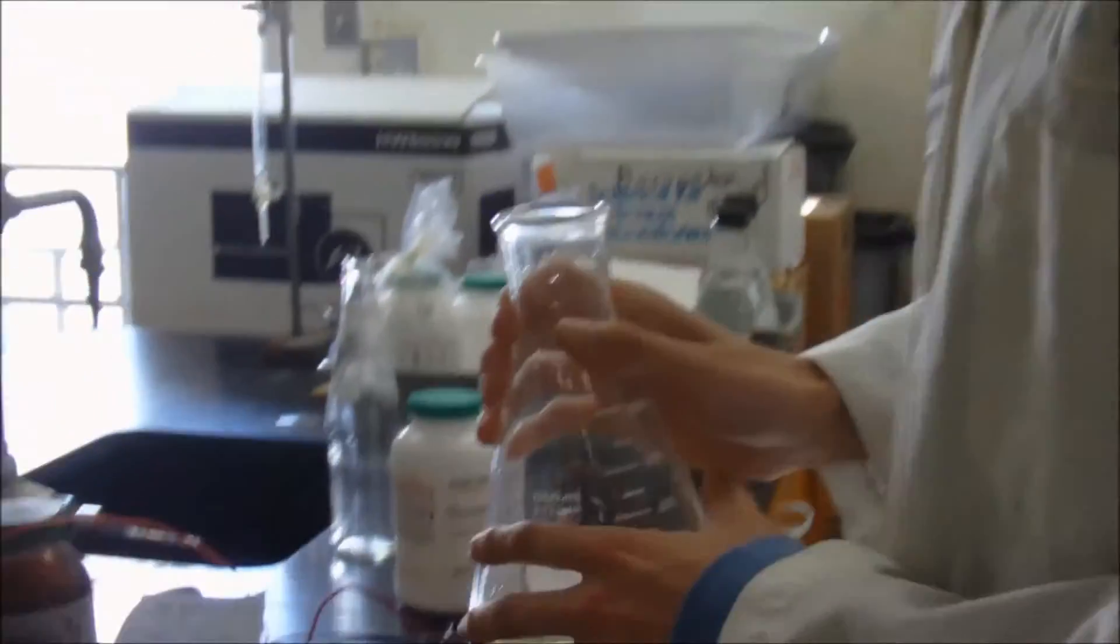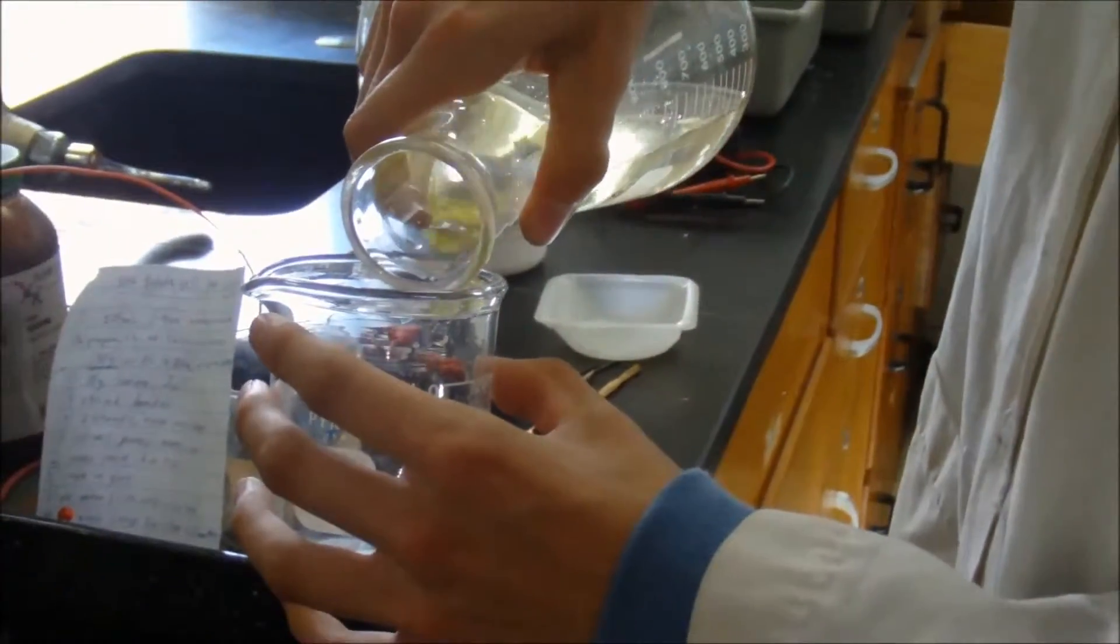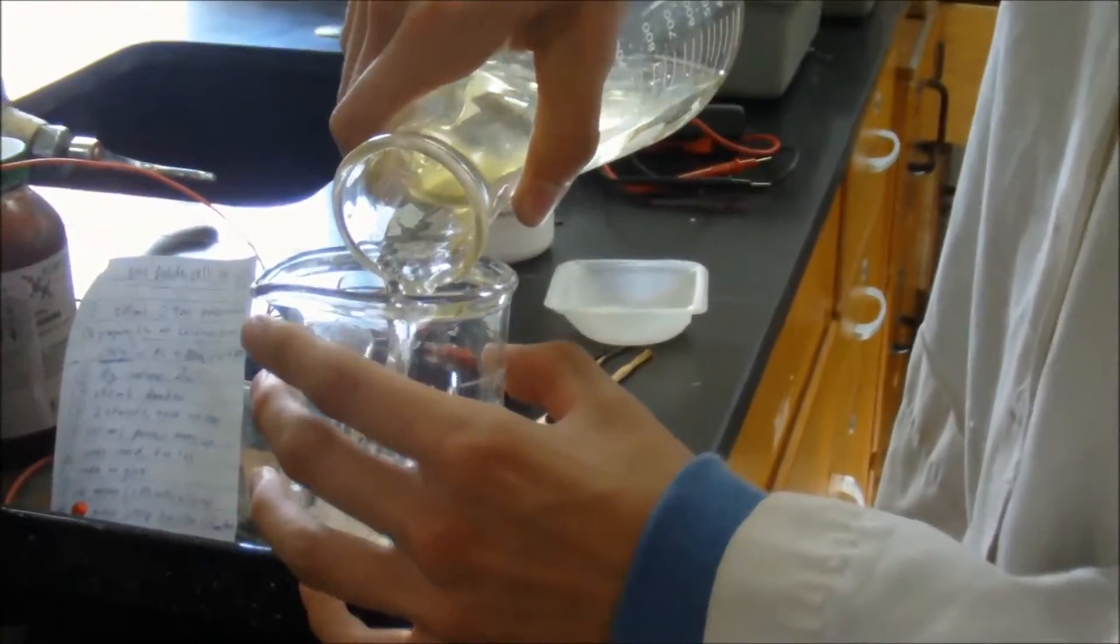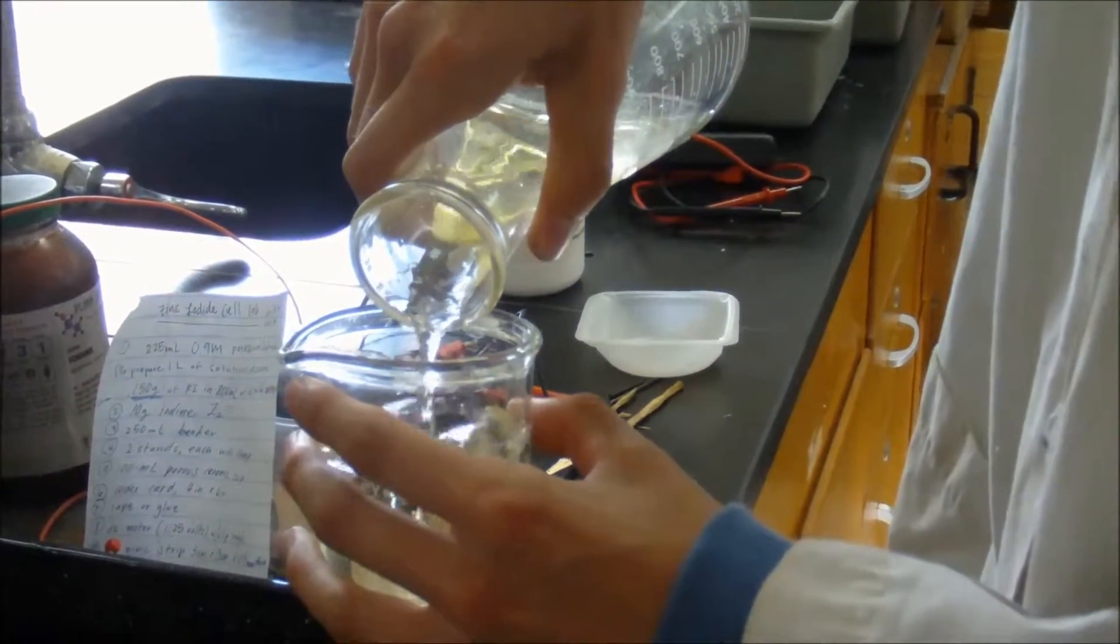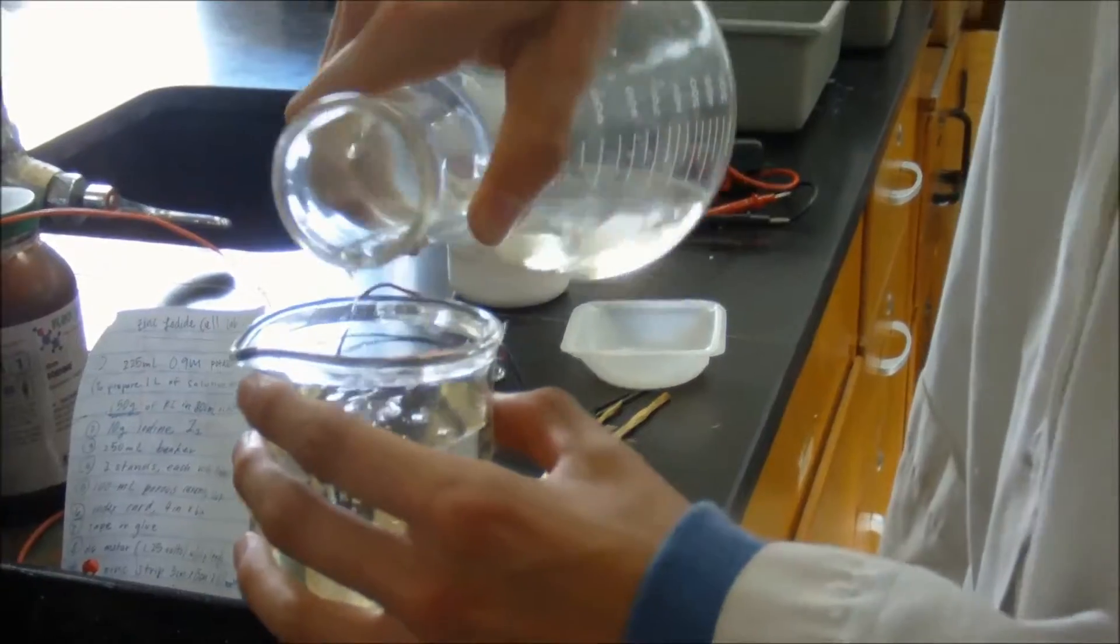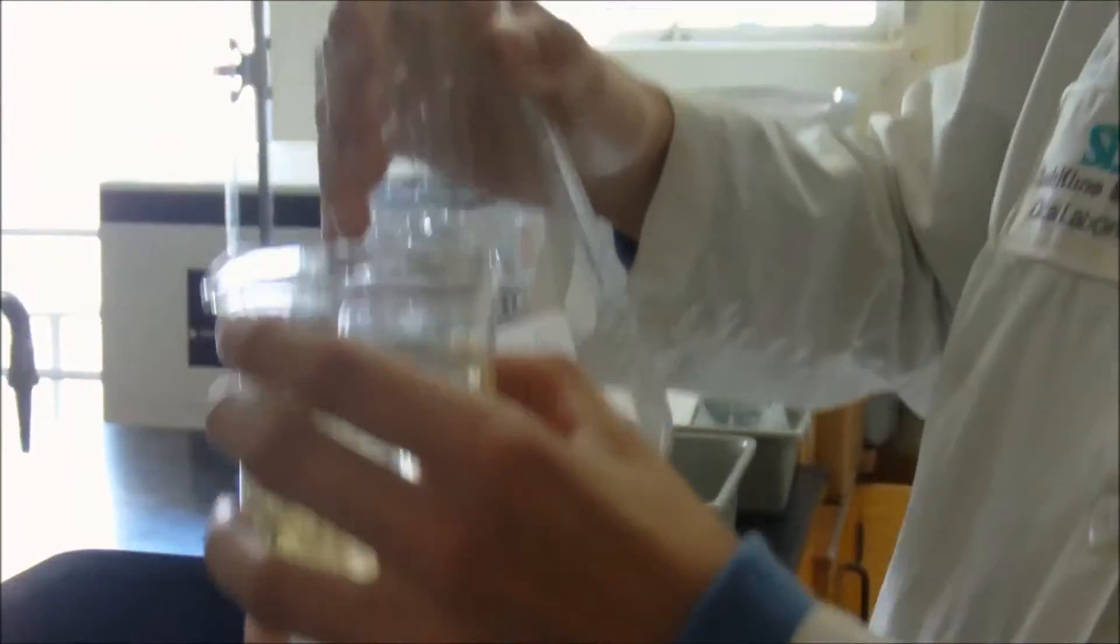What I have here is a 0.9 molar solution of potassium iodine. I'm going to fill the beaker up to 200 milliliters. I measured the volume of the flask and it is approximately 200 milliliters.